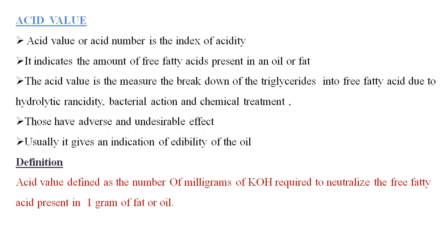Acid value or acid number is the index of acidity. So this acid value is used for determination of acidity of a fat or an oil. It indicates the amount of free fatty acid present in an oil or fat, used to determine how much free fatty acid is present in an oil and fat.